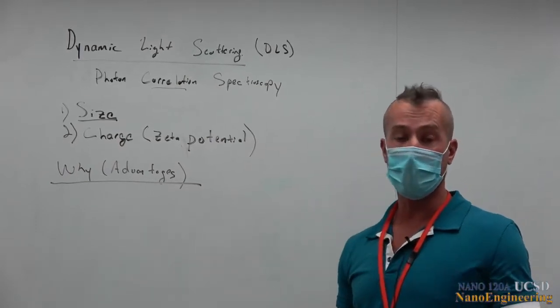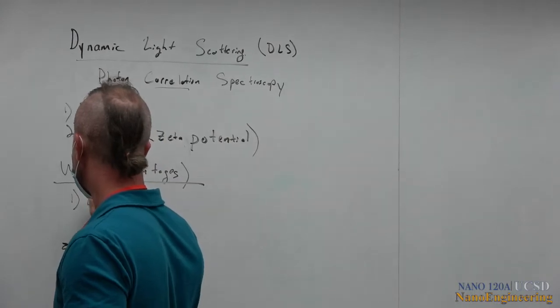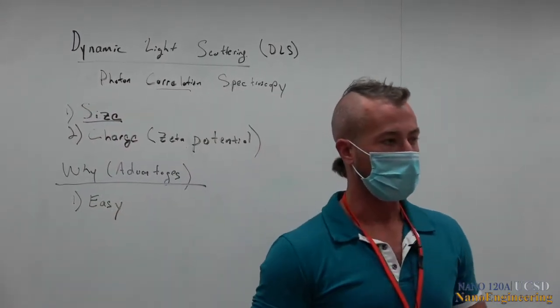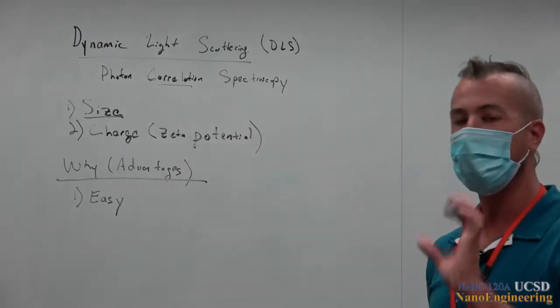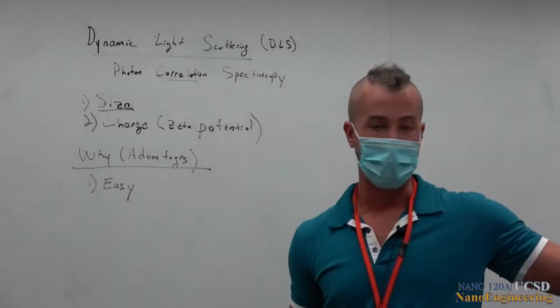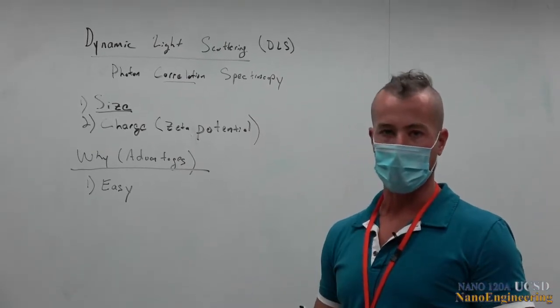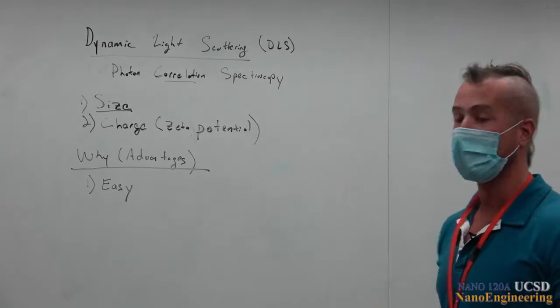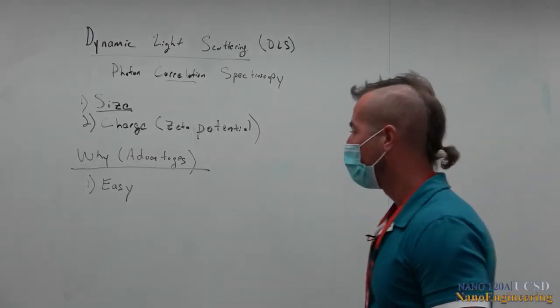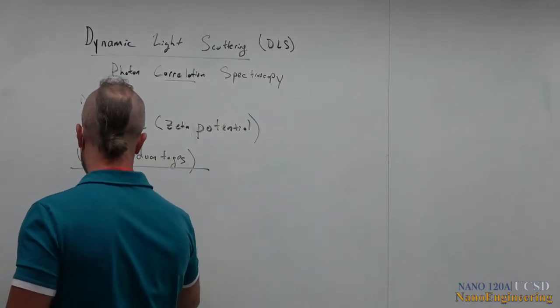The first is that it's just really easy, right? This has been around for about 30 years. It's really easy to put your sample in a cuvette, drop it in the instrument, and hit play, right? This isn't like electron microscopy or AFM where you need months or years of training to become pretty good at it. The second one is that it's non-destructive.